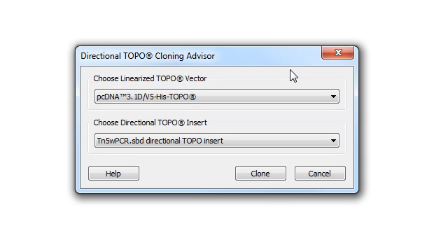Now if you want to use a vector that's not within the catalog, you can create a custom TOPO vector from your own sequence. And there's actually a shortcut you can use to do that. And I'm going to show you how to do that quickly before I finish creating this clone.